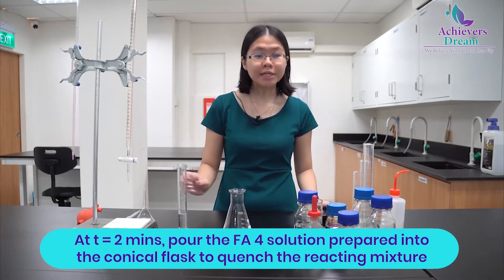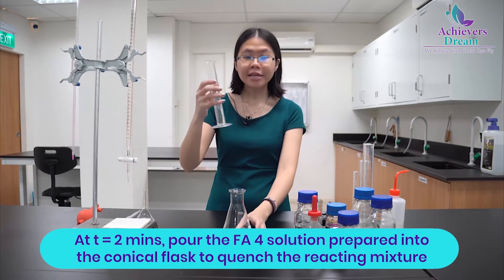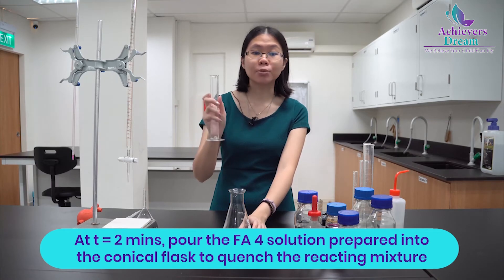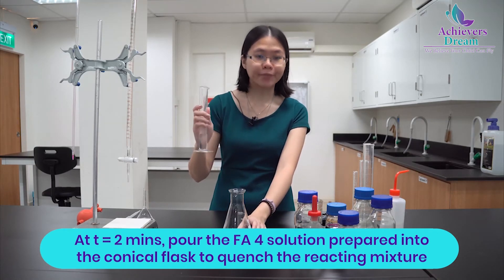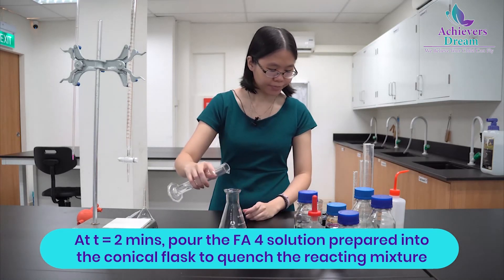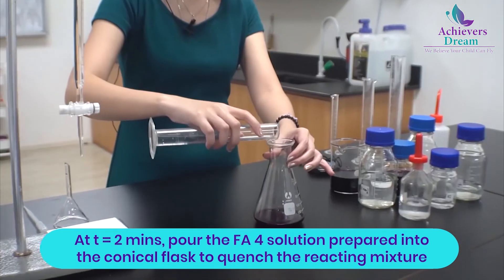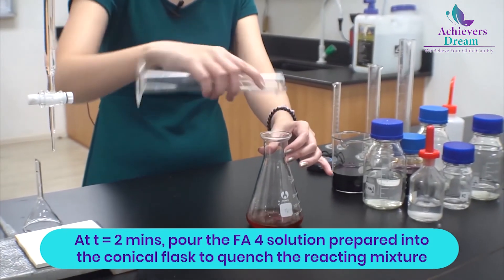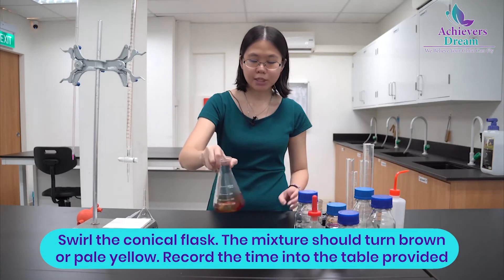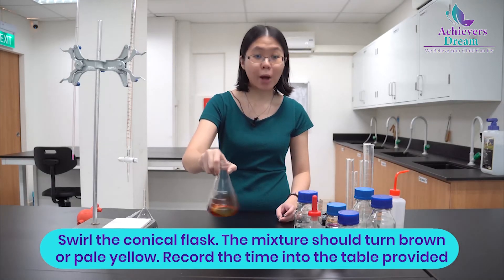At the 2-minute mark, add in your FA4 solution, which is your potassium iodide that you have pre-prepared, into the conical flask to quench it. Swirl the solution to make sure it mixes very well.